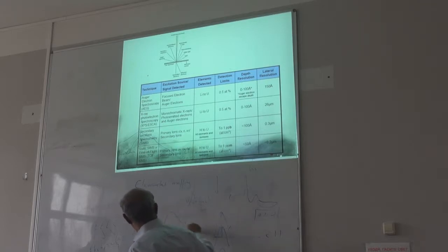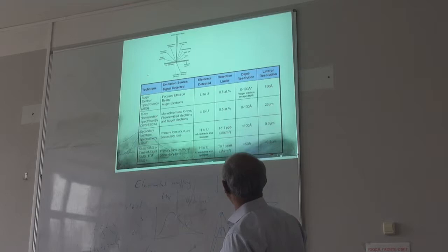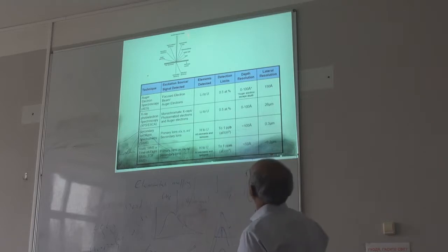Then you have the sharp X-ray peaks, like copper alpha or copper beta, coming from scattering. Then sometimes you can have fluorescence, like visible light.